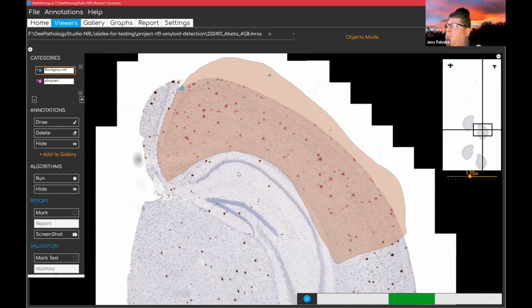In future, this will become much easier. As I said before, we are working on establishing a combination of a mouse Paxinos atlas and automatic detection in mice of cortex, for example, or other structures, so that the AI can first detect the location you want to have, and then the objects in the location. And if you run this fully automated, then you don't have to do anything anymore. You just learn the objects, and then you will get the segregated information in your results Excel sheet with all the objects. So now we are nearly done.